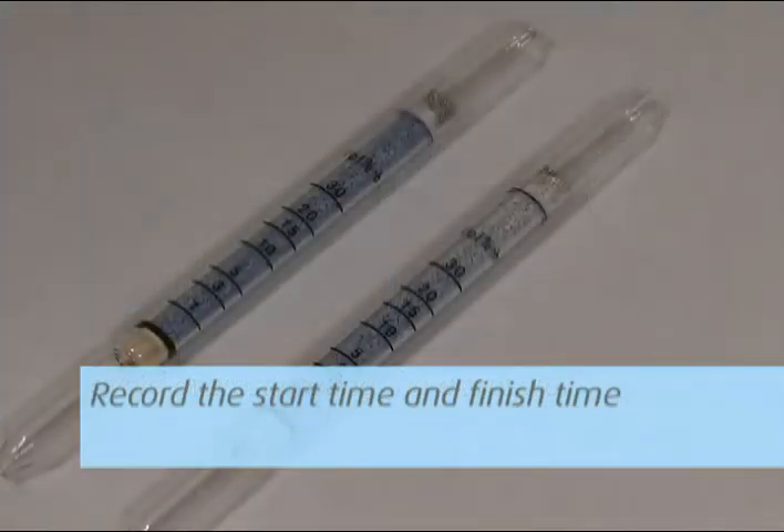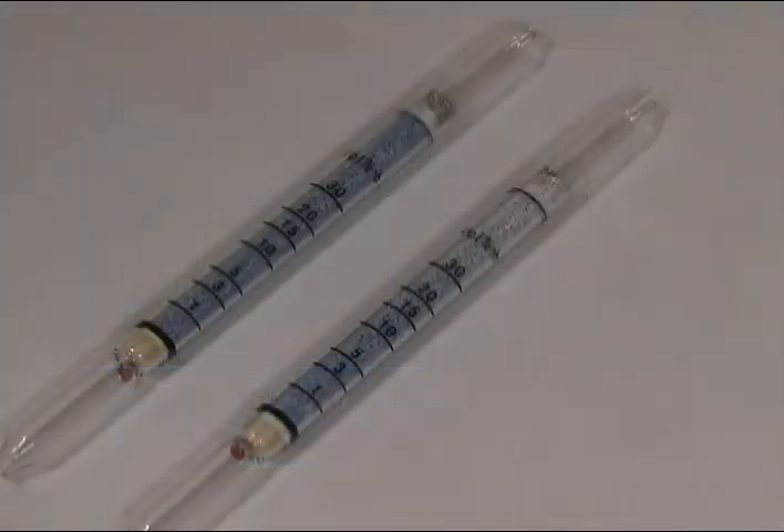Record the start time and finish time. It is recommended that you sample for four to ten hours with the tubes. The tube is filled with material that will change color in direct proportion to the contaminant being measured.